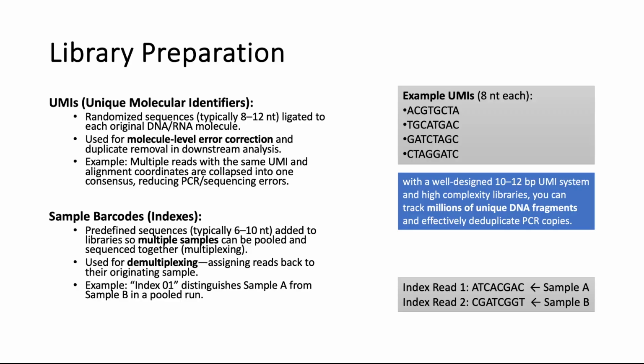What's interesting for bioinformaticians in the steps is library preparation. It will be addition of unique molecular identifiers, which are random sequences, which are added before amplification of our DNA sample, and they will allow us to connect different reads which are related to a certain initial molecule, initial part of DNA.